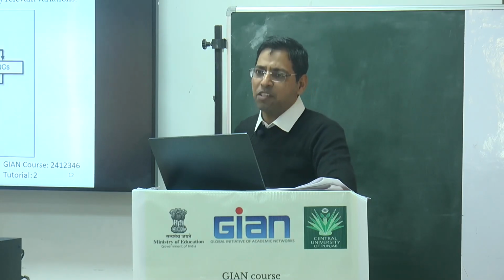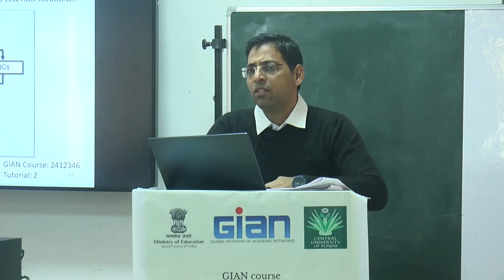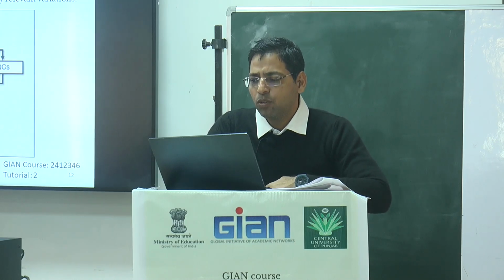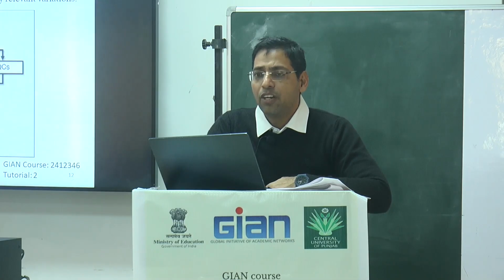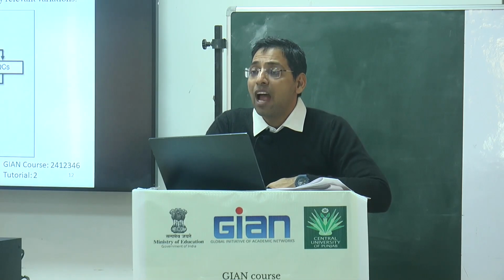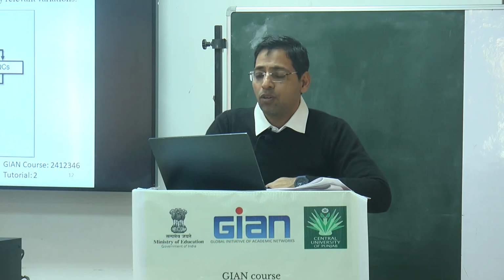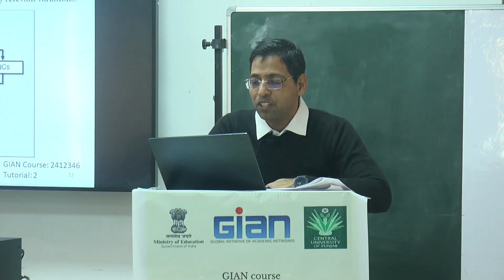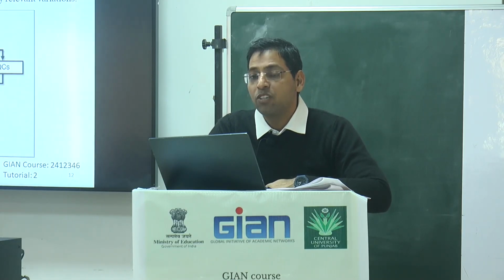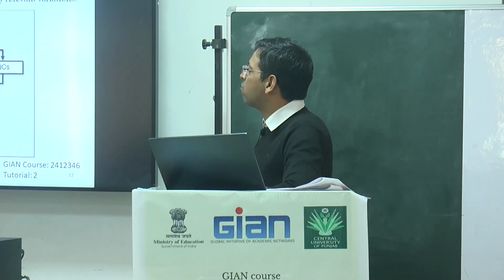Normalization is another step in the quantification. Normalization, the same thing we told during the NMR. We have to go ahead with the normalization. You have to remove all the unwanted variations which happen during the sample biasness, technical biasness, or any other type of biasness which comes here. So here I am using the word noise and the noise, both of the things. So review of the variation, confounding variation.